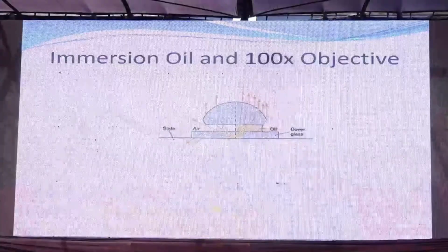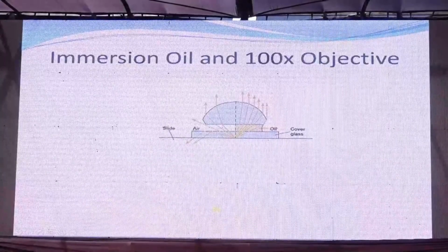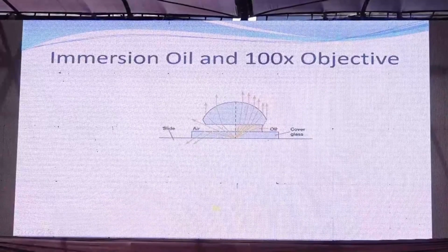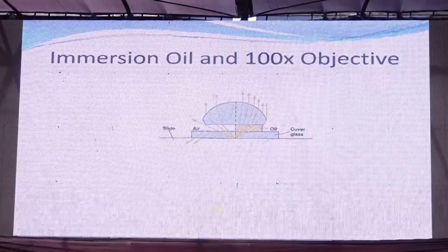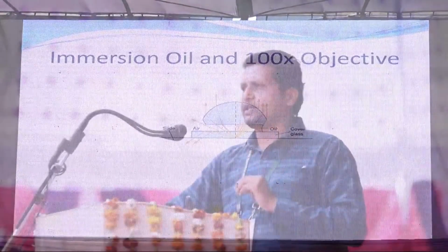If you have closely observed, the distance between the objective lens and the stage is in centimeters. Once you focus it, then you shift to 40x magnification power of the objective lens, and you observe the working distance between the stage and the lens decreases.